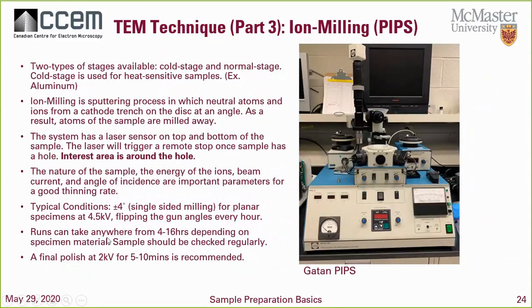But anyways, runs can take anywhere from 4 to 16 hours. Again, it all depends on the size, on the depth of that dimple that you made, and on the material. If you have something that's extremely hard, something that you know is going to take a very, very long time, beware, you're going to be milling for 13, 14, even up to 16 hours.